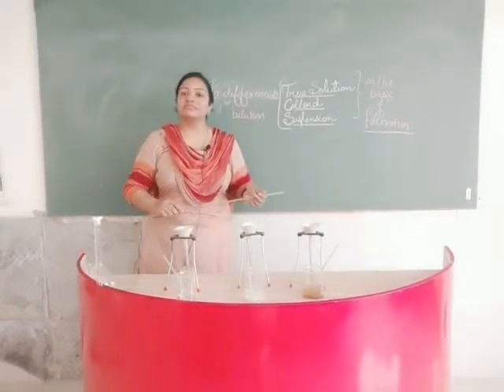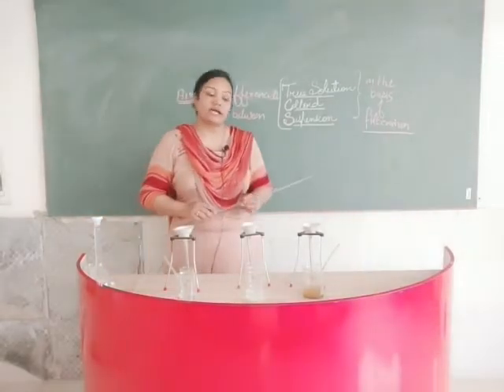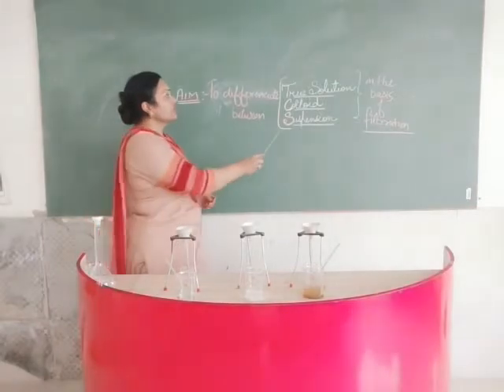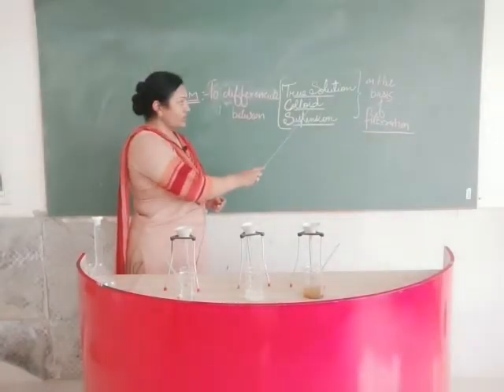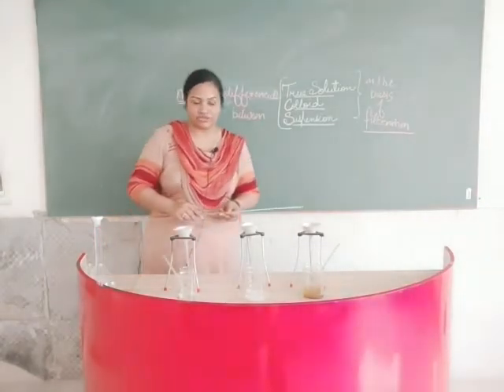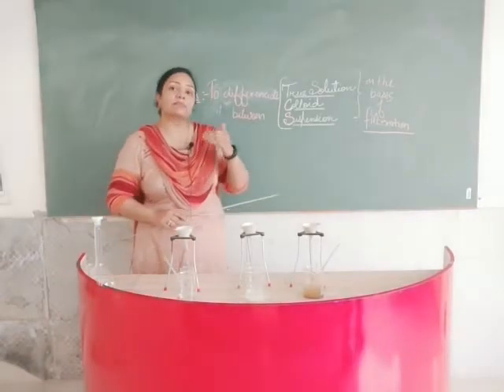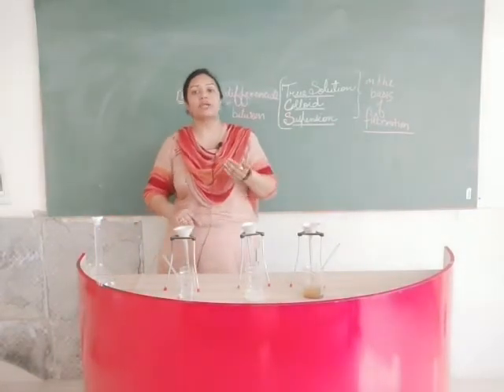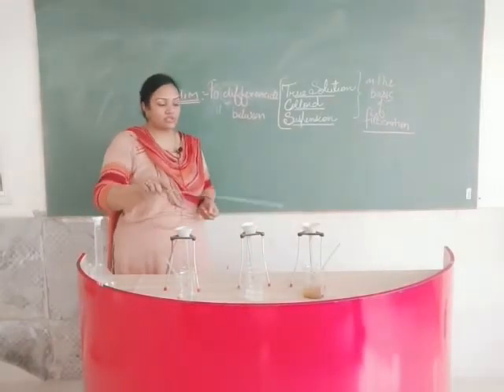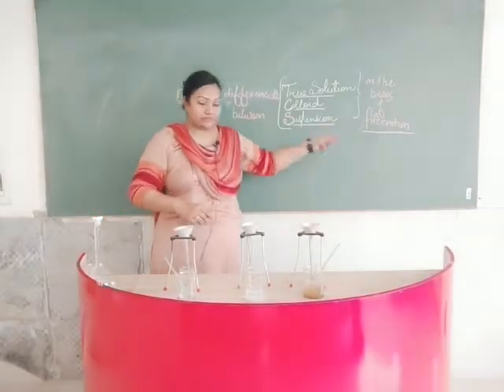Hello dear students, today we are going to conduct our practical on how to differentiate between true solution, colloid and suspension on the basis of filtration. So we are going to do this experiment. We have already prepared true solution, colloid and suspension in our previous class. So we are going to differentiate these three solutions on the basis of filtration.